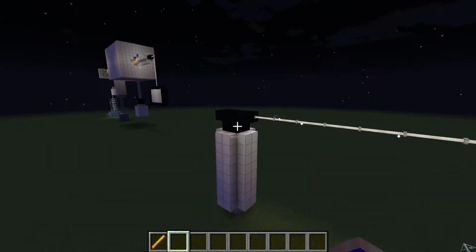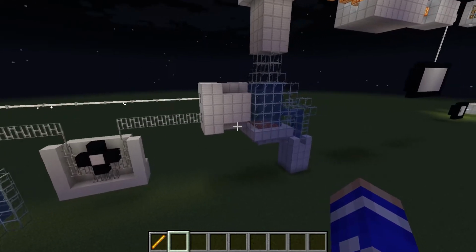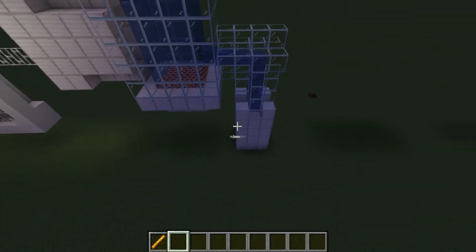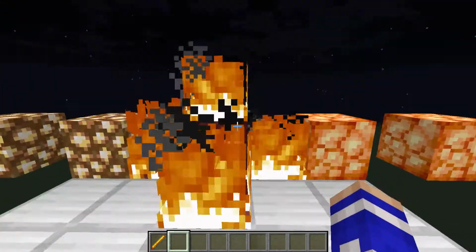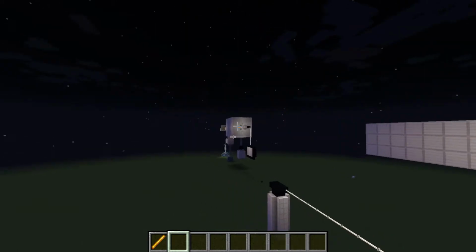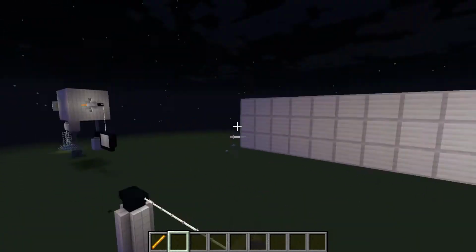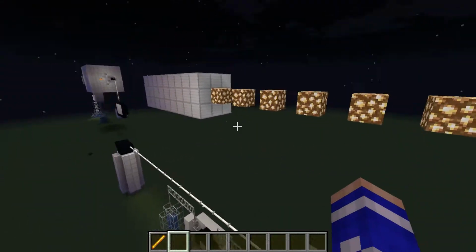We're going to be mixing specifically with argon gas this time. That's going to go into the same machine here where it's mixed. We have our waste coming out, and it'll be nebulized, and the gas is going to come out from the top here. Now what's different is that we don't have a light system, so to speak. We don't have like a lamp that's shooting light into here. Instead, our plasma flame is going to be our light.